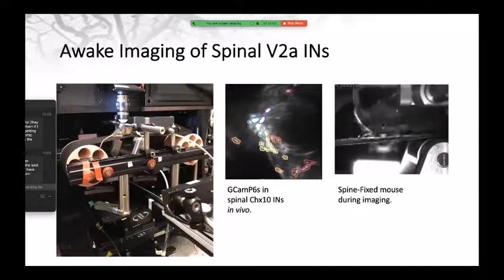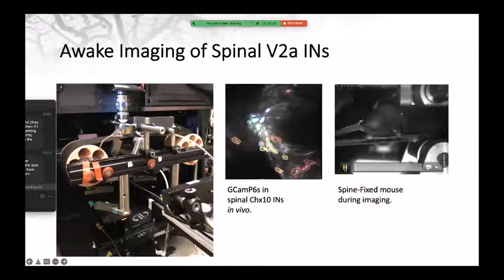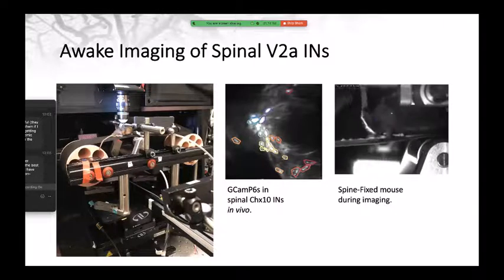So this is an older version of the linear treadmill, and there were some pros and cons to it. The pro is that for this version of the treadmill, there's a lot more data that we could extract. There are built-in sensors in this treadmill that allow us to extract data such as distance, speed, etc. And we made some additional modifications to modify the speed of the treadmill as the mouse ambulates. So this here is actually forced running, which required a lot of training for the mouse.